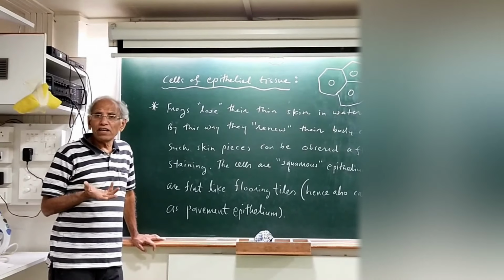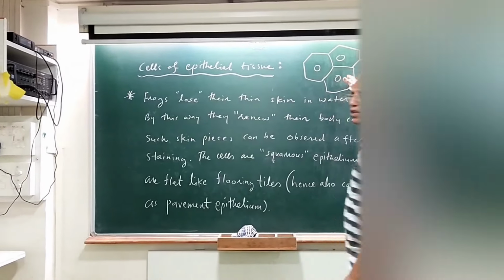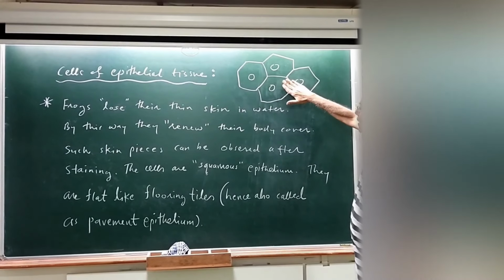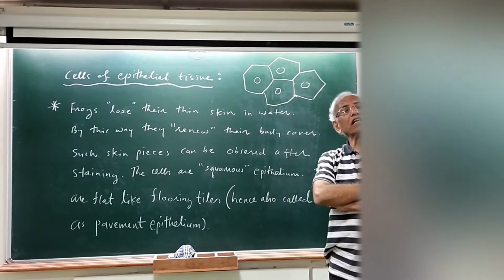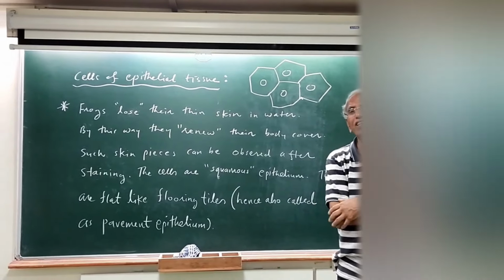Cells vary in size and shape. Let's have one example of the kind of cells that we can observe under microscope. These appear to be polygonal cells, and these are actually flat cells of the skin. We also have these cells in this flat form, but our skin cells are being lost daily, and so it is not easy to collect those skin cells.